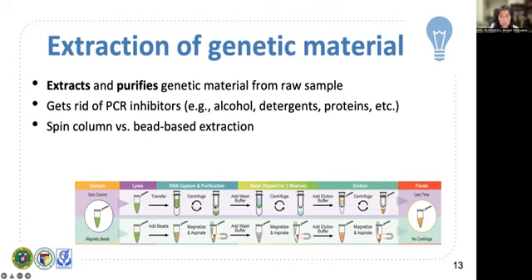Whereas in your bead-based method, you actually exploit the affinity interactions between your nucleic acids and the molecules that are attached to the surface of the magnetic beads. And that is how we extract and purify the nucleic acids from your sample.